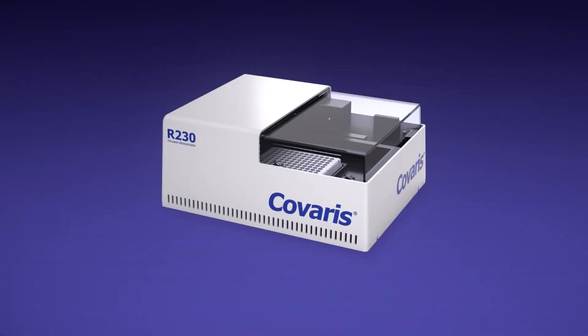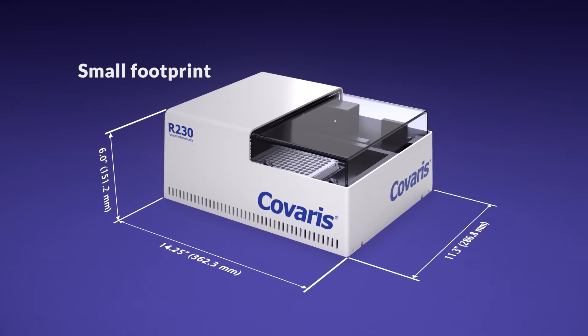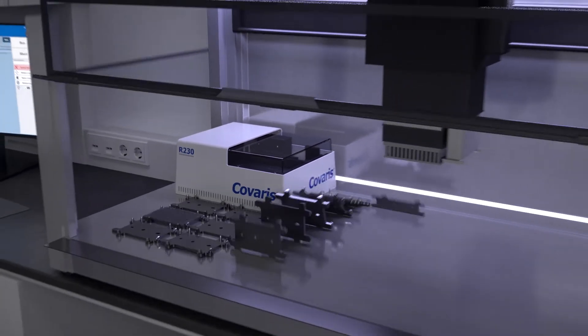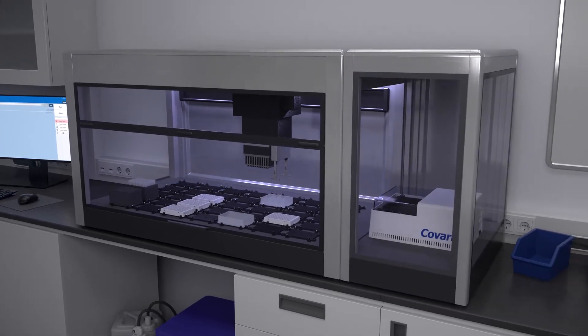This multifunctional, reconfigurable system has a small footprint, saving precious lab space, and can be integrated with liquid handlers either directly on-deck or deck-adjacent.